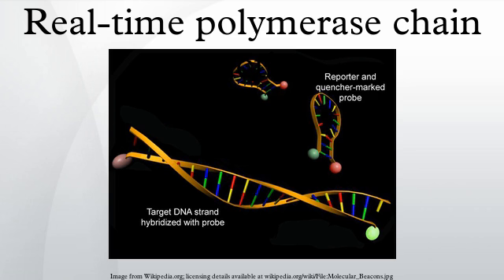Microbiological uses. Quantitative PCR is also used by microbiologists working in the fields of food safety, food spoilage and fermentation, and for the microbial risk assessment of water quality and in public health protection. The antibacterial assay virtual colony count utilizes a data quantification technique called quantitative growth kinetics that is mathematically identical to qPCR, except bacterial cells, rather than copies of a PCR product, increase exponentially. The QGK equivalent of the threshold cycle is referred to as the threshold time.